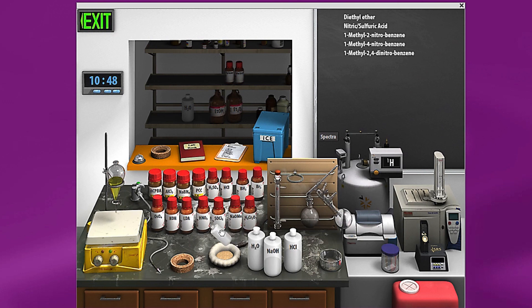Then you'll bring over something aqueous. In this case, I'm using water for the extraction. You can see the water, the aqueous layer has your acid in it, and your organic layer has everything else in it. What you can do here is grab your aqueous layer and discard it because it doesn't have anything that you need.